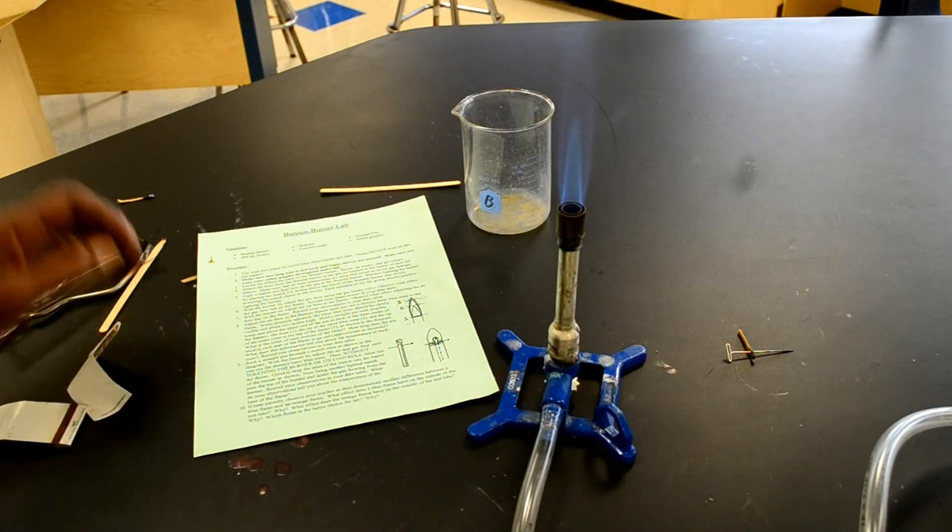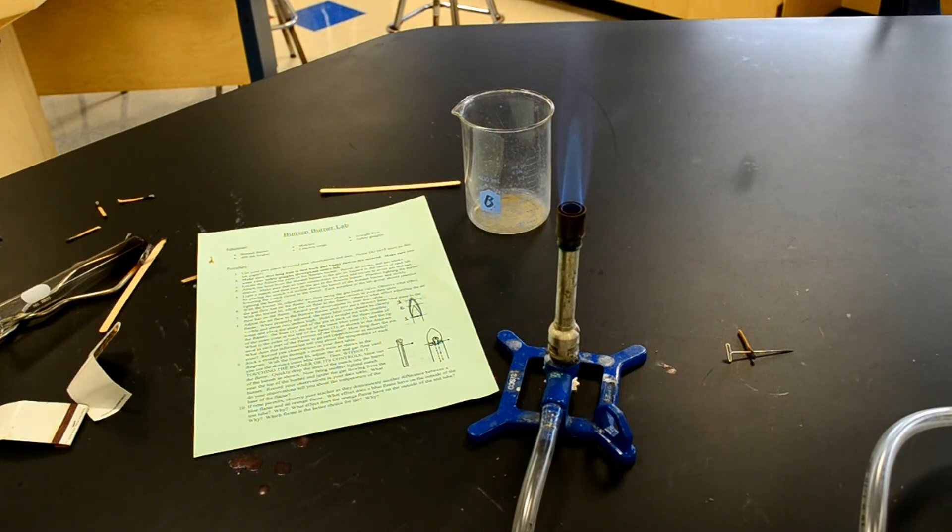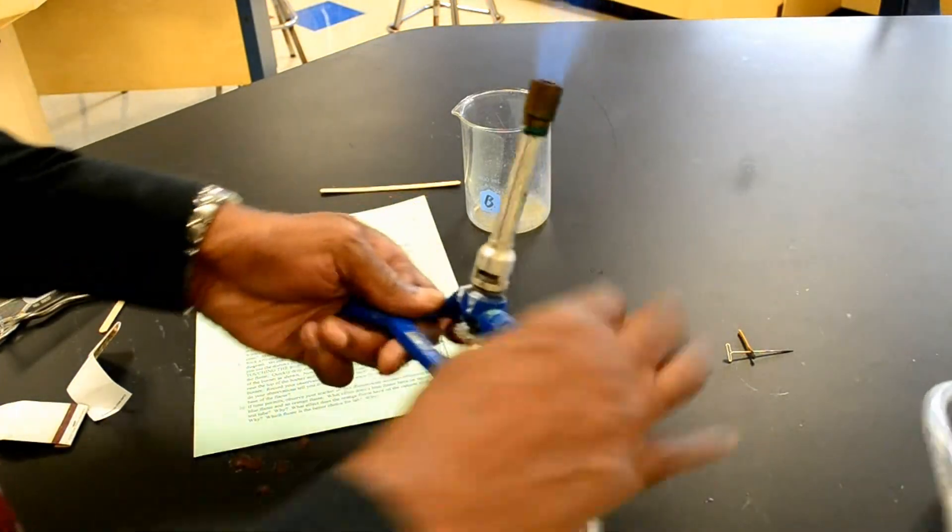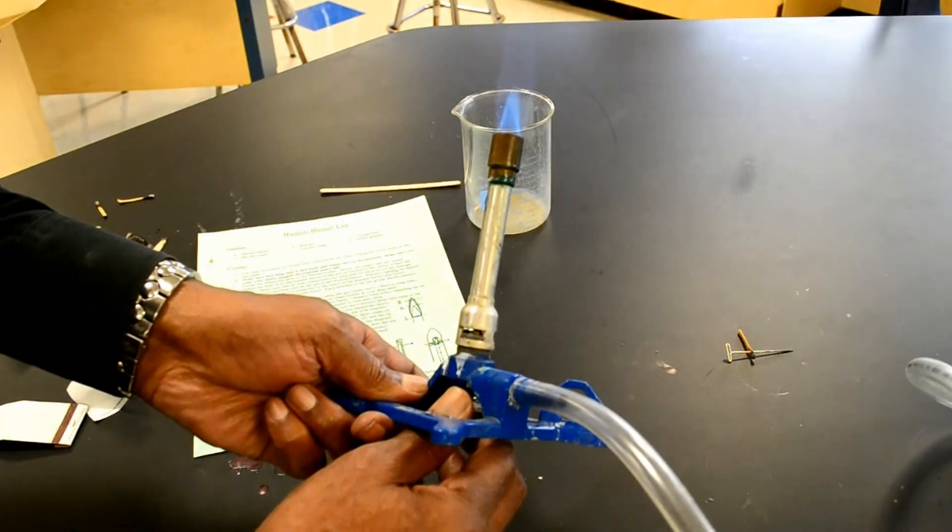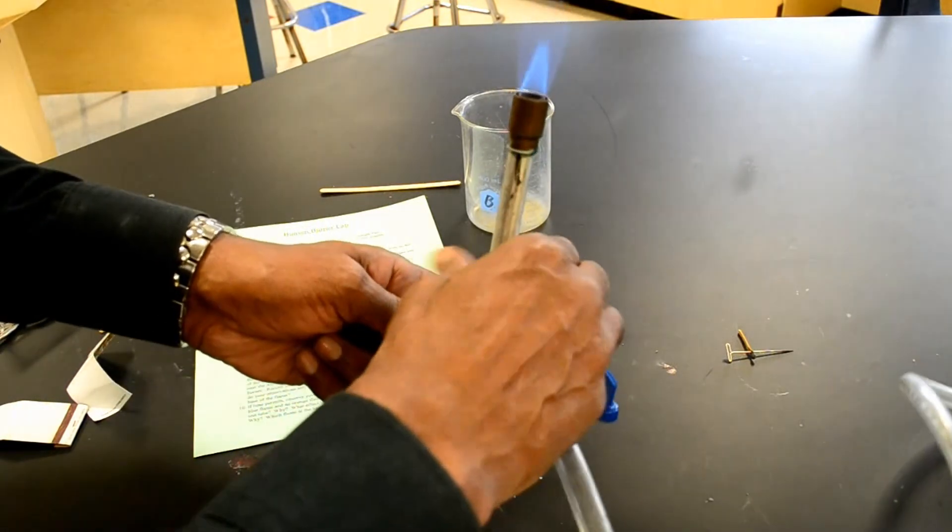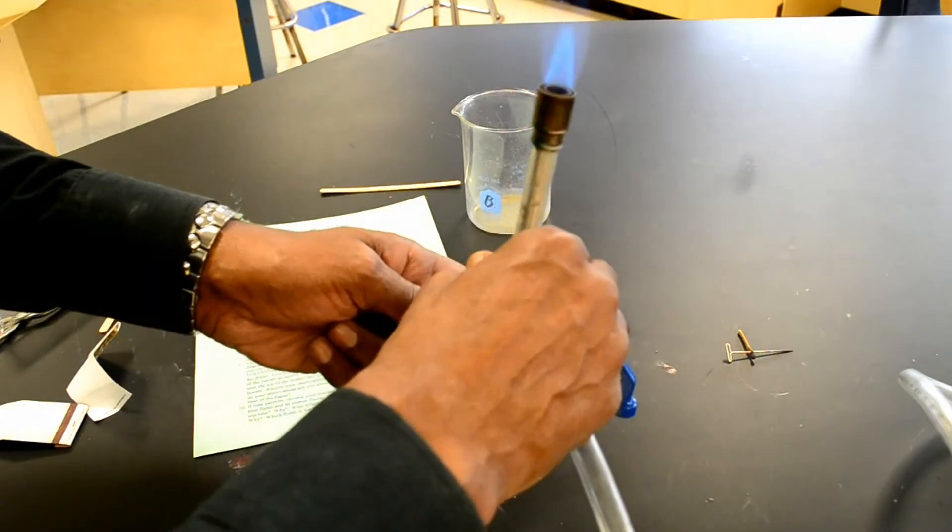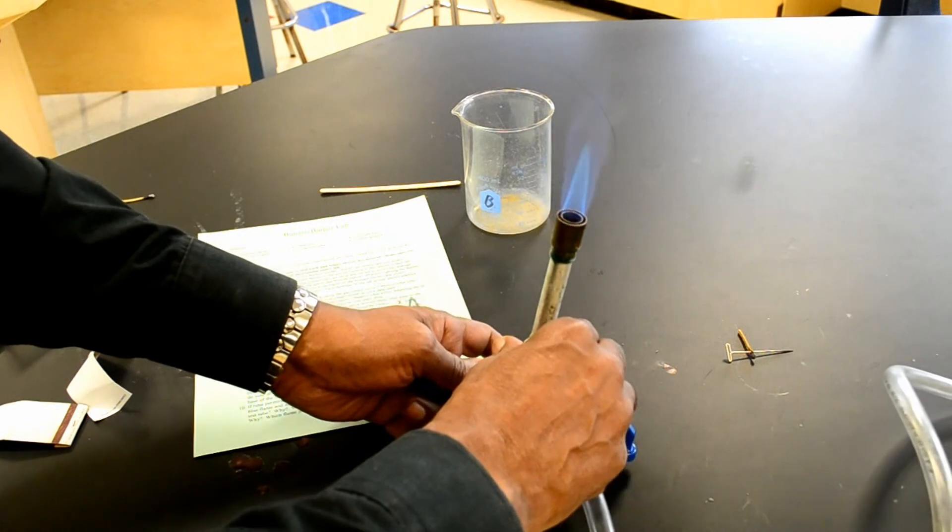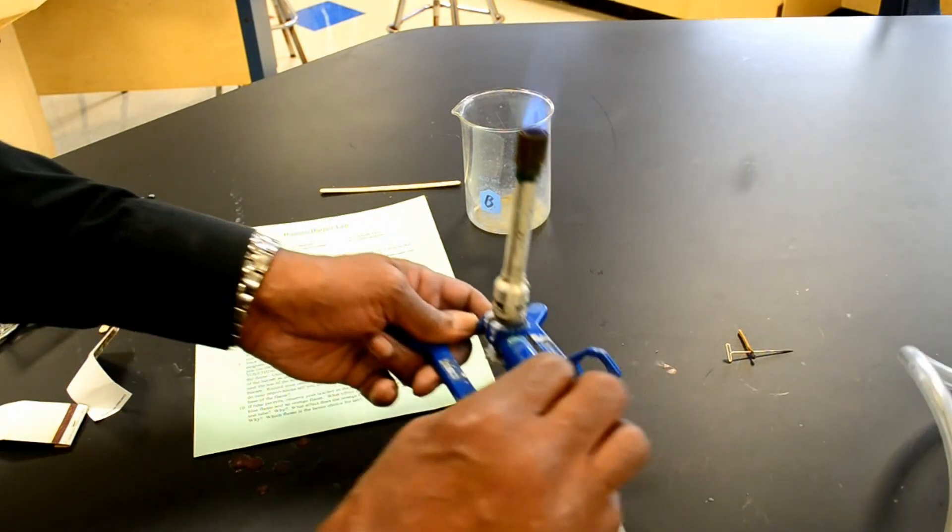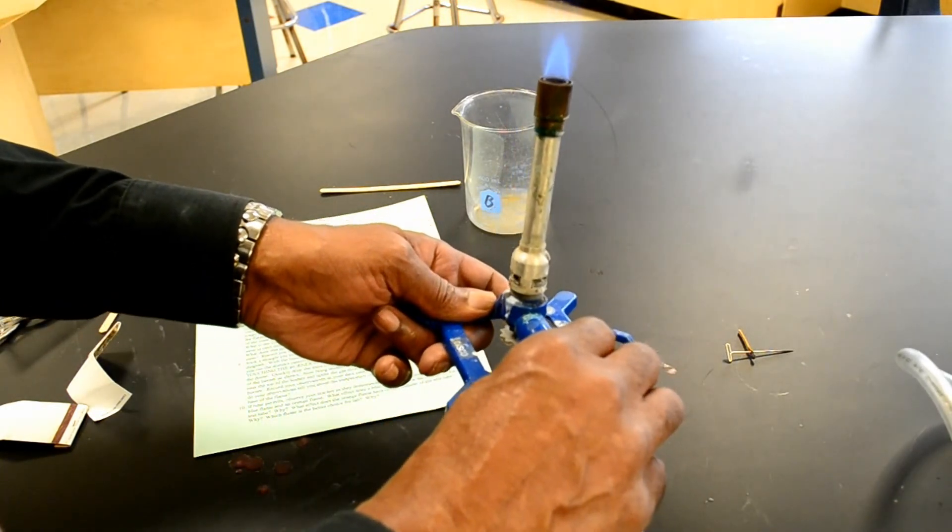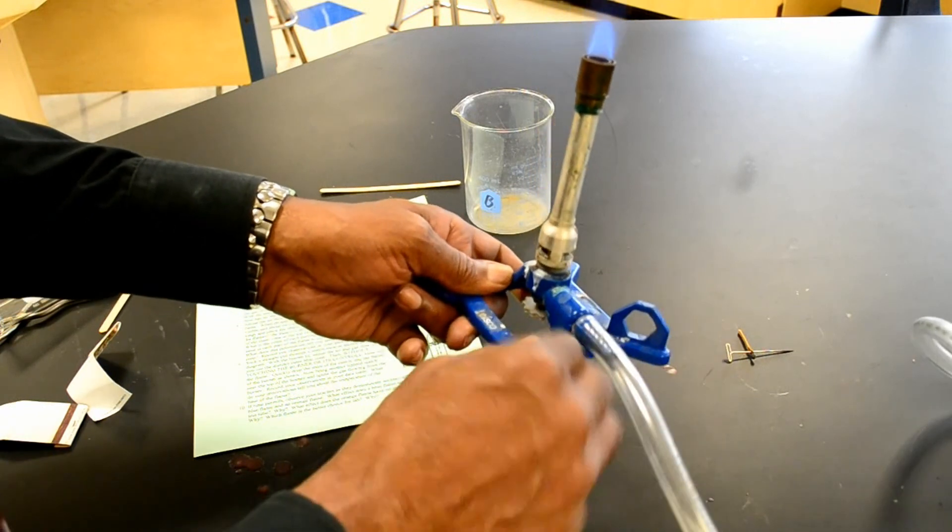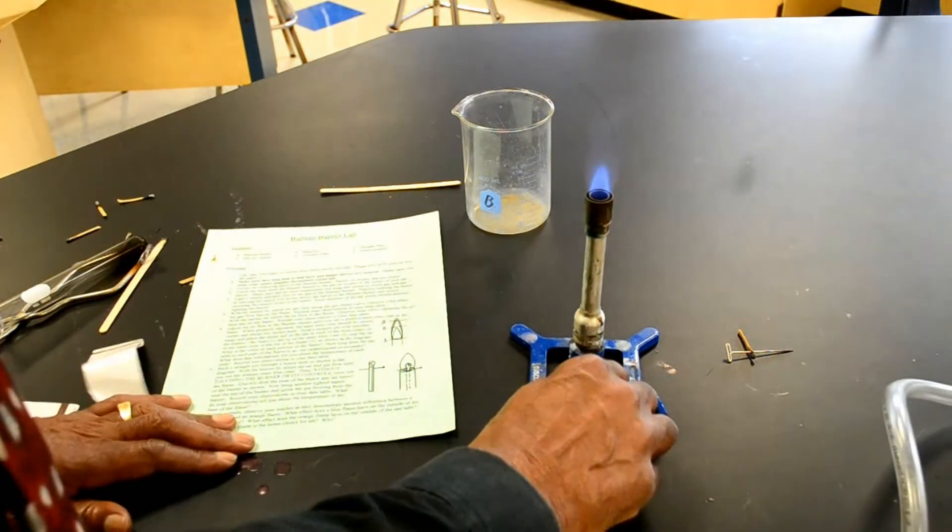So that's pretty much how to use the Bunsen burner. On the bottom, we have the spud. The spud controls the height of the flame. We have the air intake, which allows oxygen to get into the burner. The more oxygen it gets in, the hotter the flame. Gas intake tube. Right here on the burner.